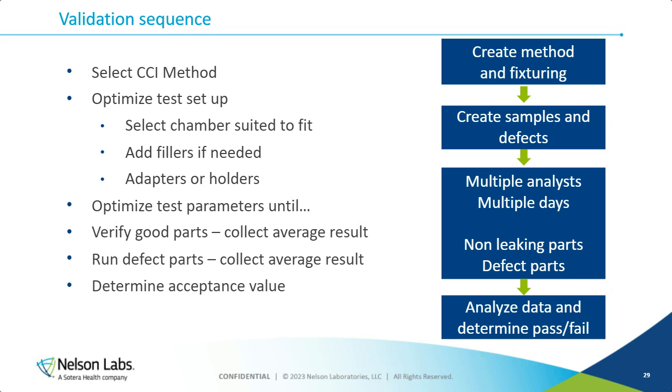You may notice from our validation that we are very fond of the number 3. Our analysts have done the testing 3 times on 3 different days. You don't see that because I only plotted day 1, but yeah, we love 3. Some people also like 2, and that's fine if that's you. Once you've gotten all that data, now it's time to crunch the numbers, analyze the data, and figure out where the appropriate pass-fail value should be.